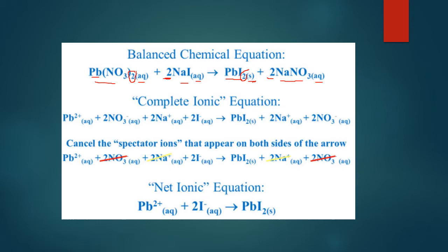Now we know a solid formed in reaction A that we saw, because that white cloudy substance was actually a solid, a precipitate. So we know that one of the products in part A is going to be a solid, using your solubility tables to figure out which one. Then the other one by default will have an AQ by it because it's aqueous, it's still dissolved in the water.